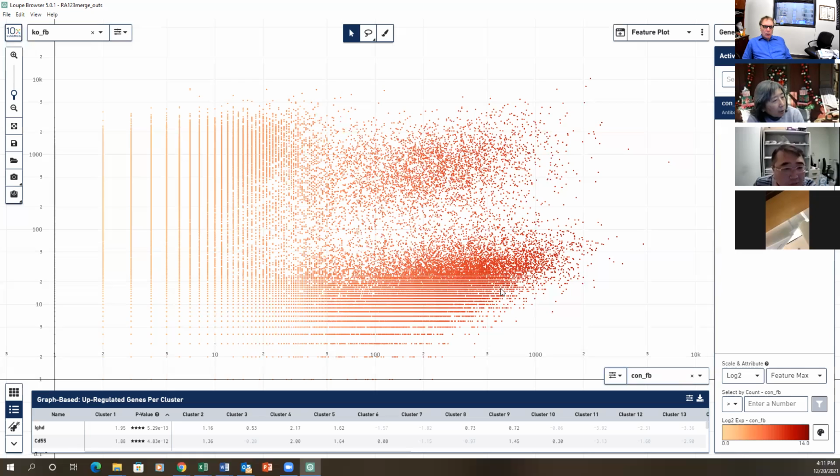I think the line is because there are a lot of cells. If there weren't that many cells, we would see all individual spots. And you probably can open the individual file, not the merged file. You probably can see right there. Anyway, here we just do a quick thing to show. So to answer Chen-Ming's question, 60.